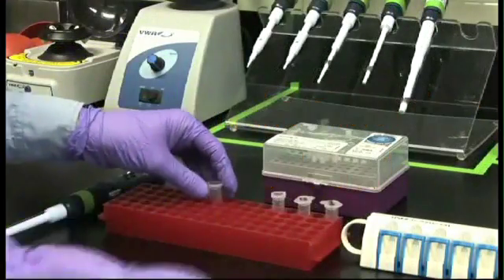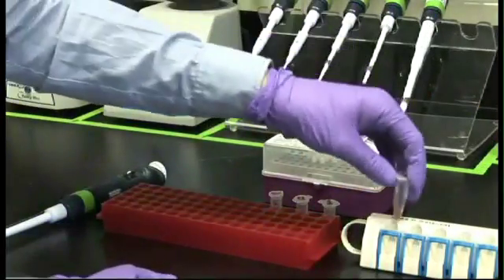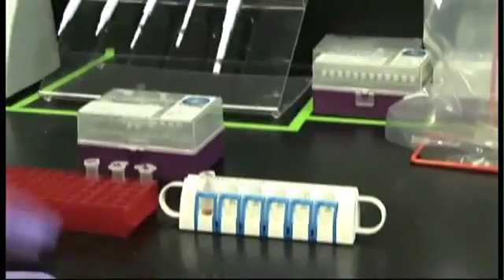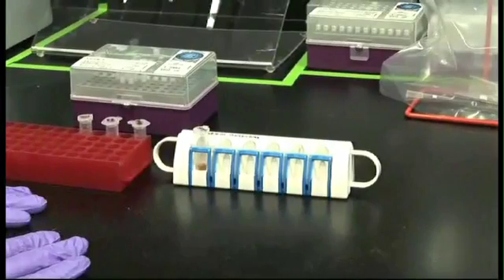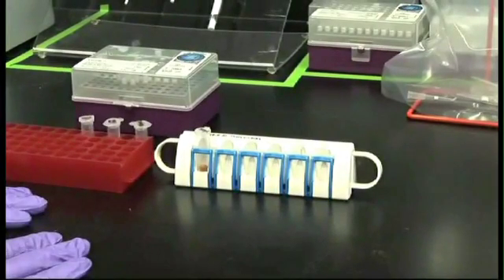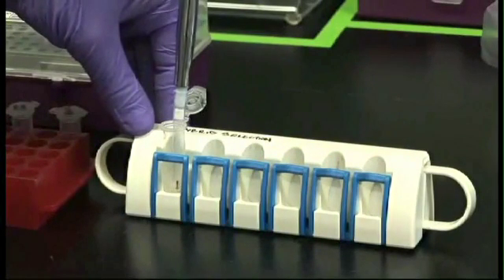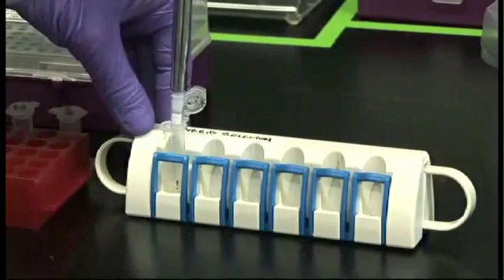Allow 2 minutes for sample DNA to bind to the beads, then put the tube on the magnet. After 3 minutes, the solution will be clear and the beads will be held to the side of the tube by the magnet, separate from the solution. Leaving the tube on the magnet and without disturbing the beads, pipette off and discard the supernatant containing unwanted material.